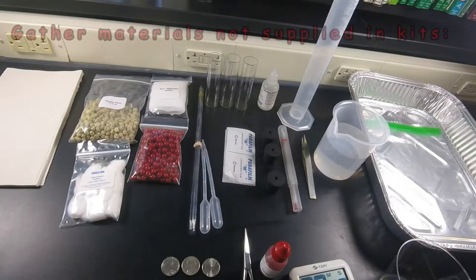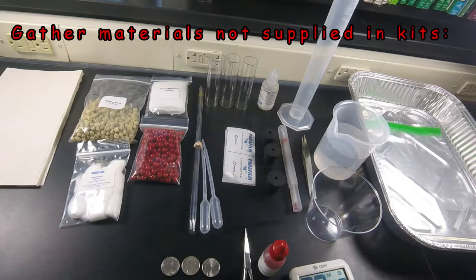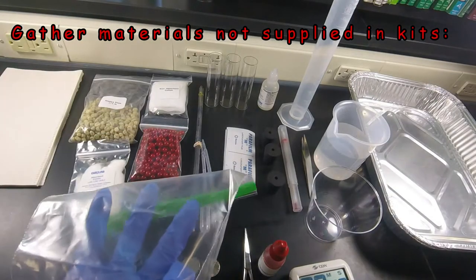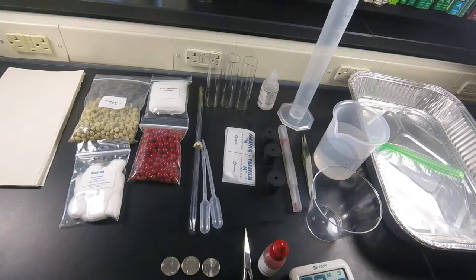For the materials that are required but not supplied, you will need a disposable aluminum baking pan, 2 9x13s, which I have here, or a single larger roasting pan. You will also need 3 nickels, a timing instrument, food coloring, a plastic cup for germination, a resealable bag, sandwich size, some paper towels, scissors, and some non-chlorinated water. Please make sure that your water is non-chlorinated, which means it is not from the tap. Bottled water could be used for this experiment.